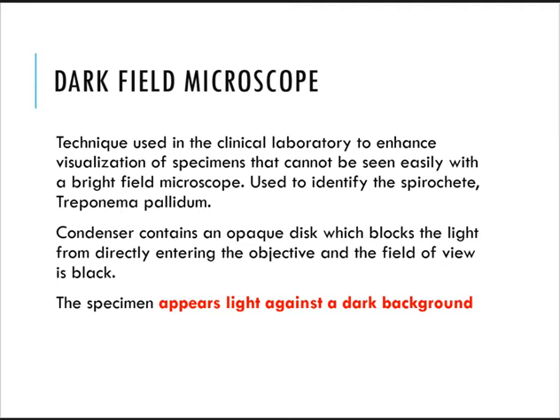Okay, so your dark field microscope, guys, is basically the polar opposite of your bright field microscope. It is a technique used in the clinical laboratory to enhance visualization of specimens that cannot be seen easily with your bright field microscope. Now it is used to identify the spirochete.